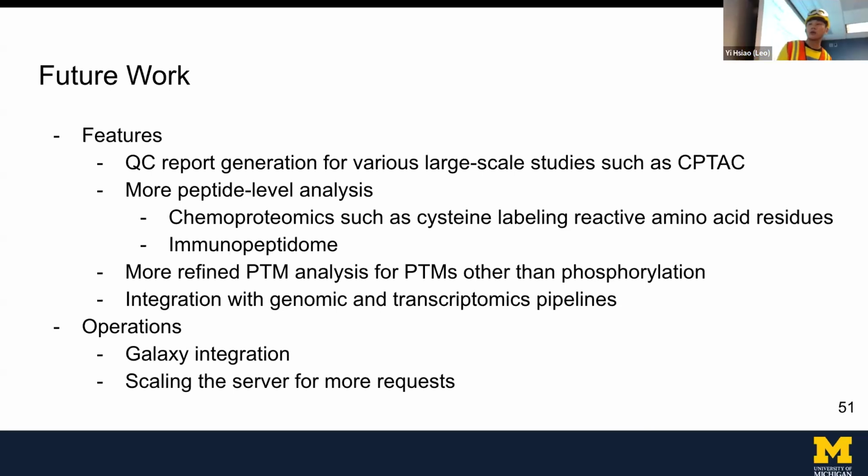Yeah, I think that's a very good question. For me, I think glycosylation will be the most interesting one. Compared to other examples you mentioned, like acetylation or ubiquitination, it is another layer of complexity, since not only is it a site-specific PTM, but glycans multiply on a site, and even on a single site there are many layers of complexity. You can have a longer glycan or shorter glycan.